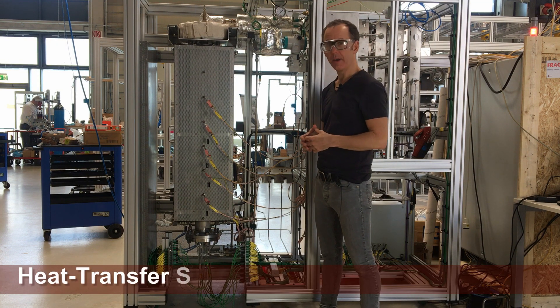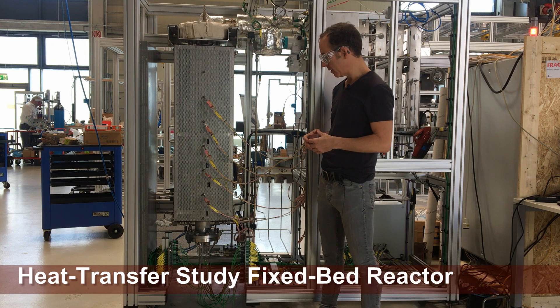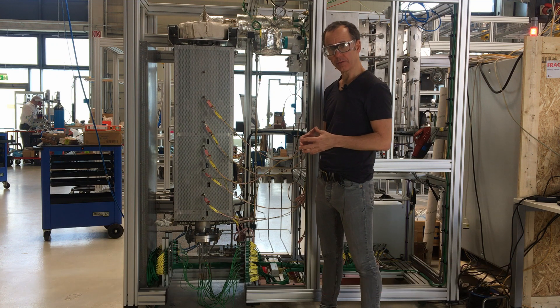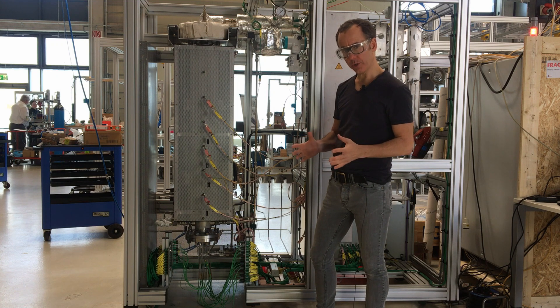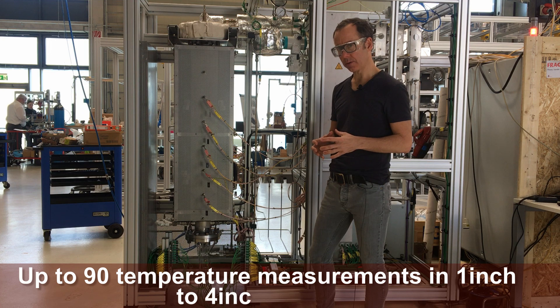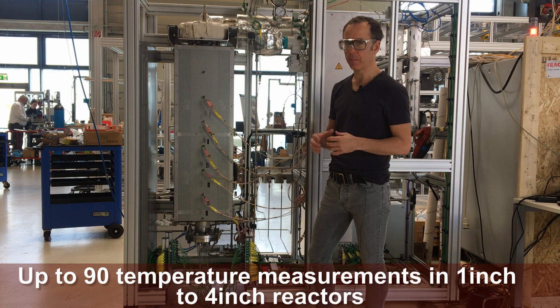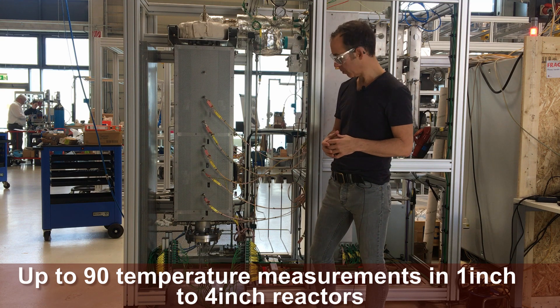Today I'll be introducing you to a novel fixed bed reactor testing system that we made at ILS. It's novel in the sense that it's a reactor used for doing thermal heat transfer studies. We have the ability in either 1 inch up to 4 inch reactors to test at up to 90 positions what the temperature is — so 90 thermocouples. We have a lot of radial measurement points and a lot of axial measurement points.